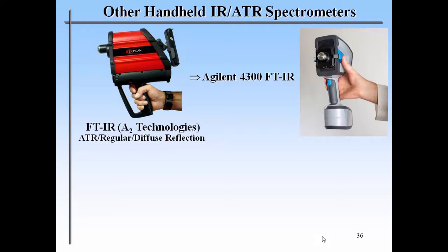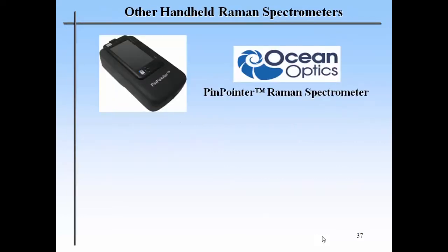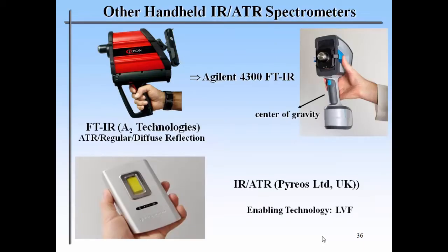handheld was an exaggeration because it weighed 4 kilos. You had to be Arnold Schwarzenegger in order to handle it a whole morning. So what they have done very cleverly, they have changed the center of gravity from here to the handle. And thereby it is much easier.